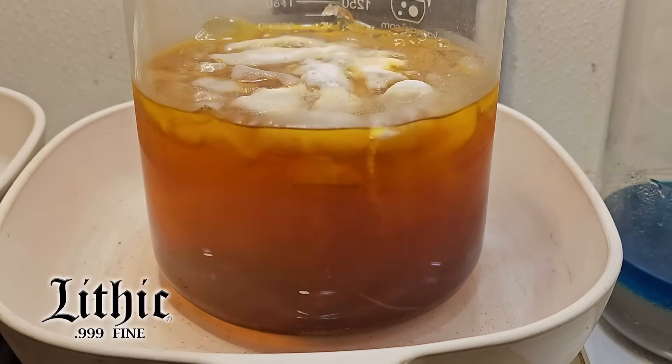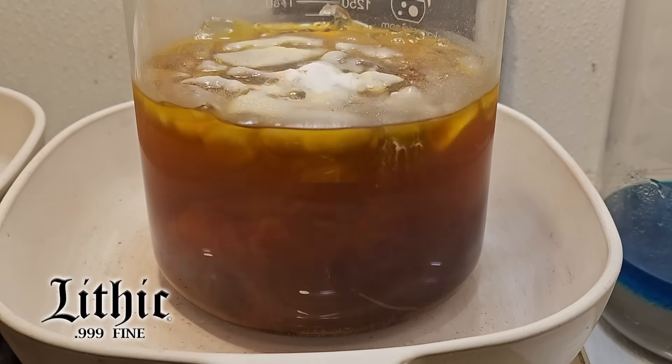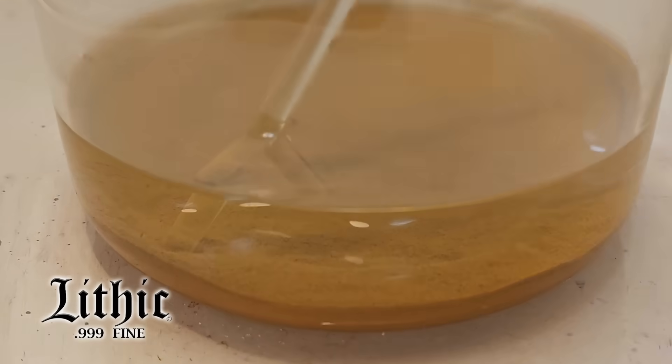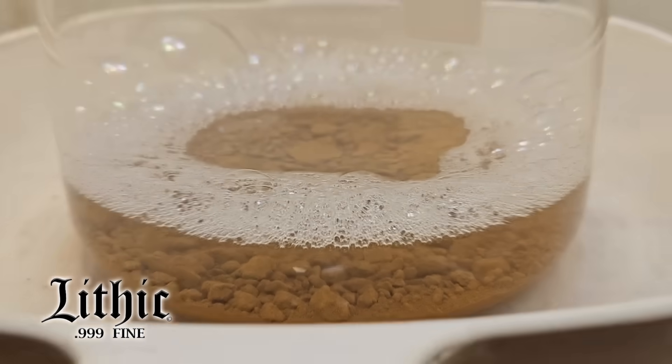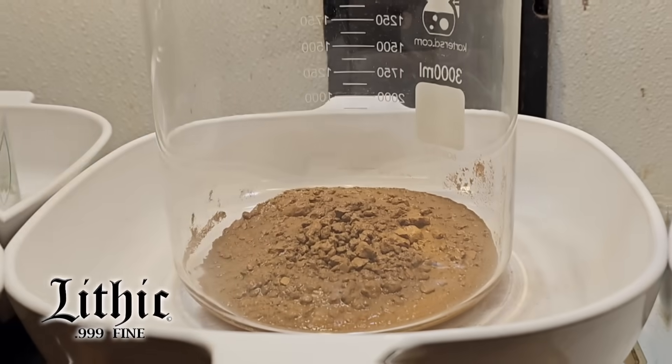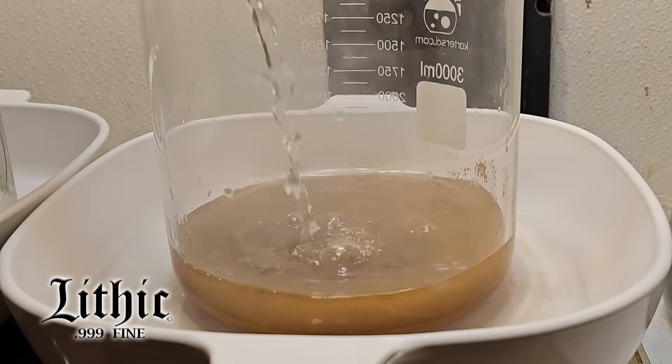Here we're going to drop this gold out of solution. I added sodium metabisulfite, or SMB, which reacts with the gold in solution, dropping it selectively out. We're left with this bit of sediment, and after a series of rinse procedures, we're left with this.